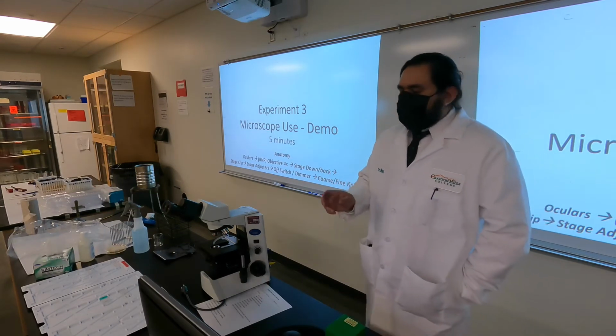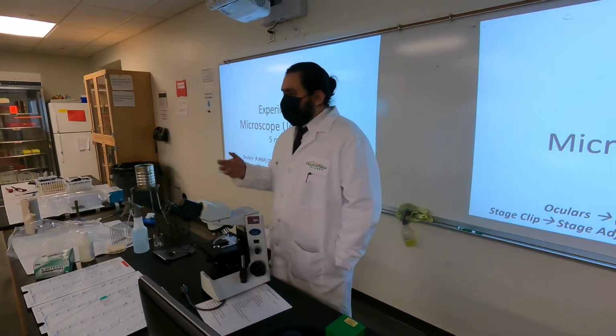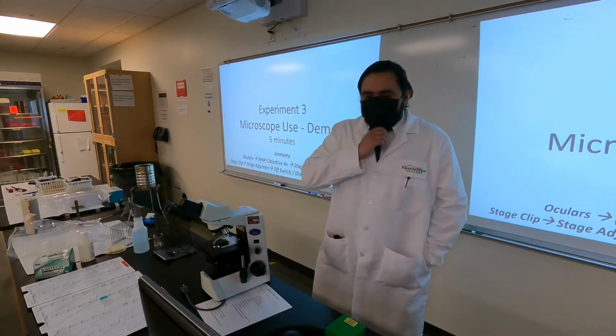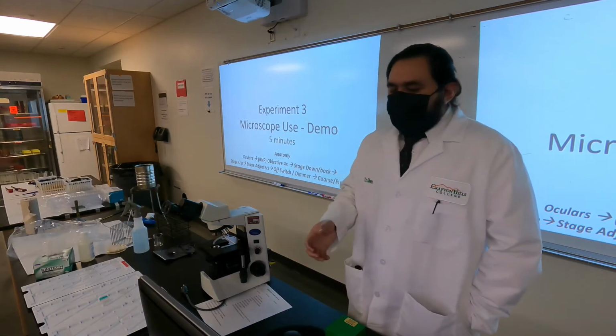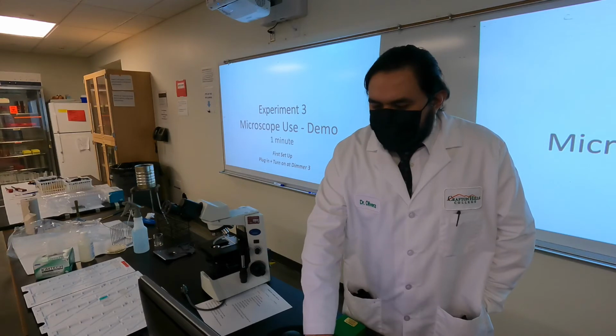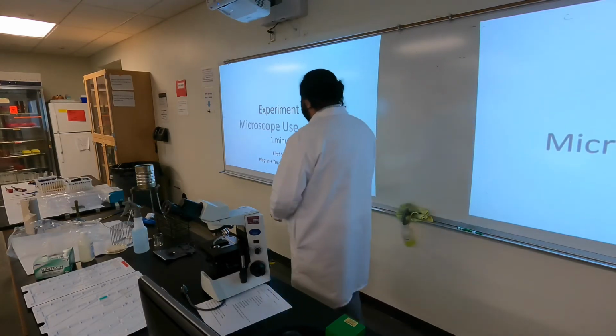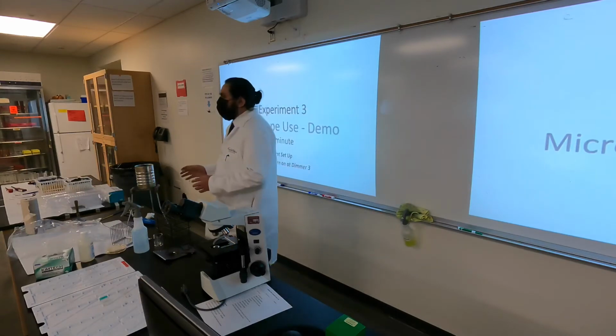And so the first slide that we're going to use, after we picked up our little slide in our slide boxes, is the triple strings example. This is the one that allows us to figure out the parfocality level. And so the idea here is we want to turn this on, and the most common thing that happens is locating where things are.